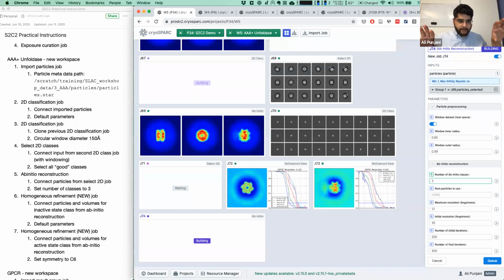They're all unknown, but they're all separate. And each particle image that we observed comes from one of those density structures, not all of them, just one of them. And so when we're doing inference in this problem, what we're trying to ask is, okay, given this model where we don't know the 3D structures and we don't know the assignment of the particles, what can we infer about the 3D structures that explain the data separately, and what are the assignments of particles to each class.